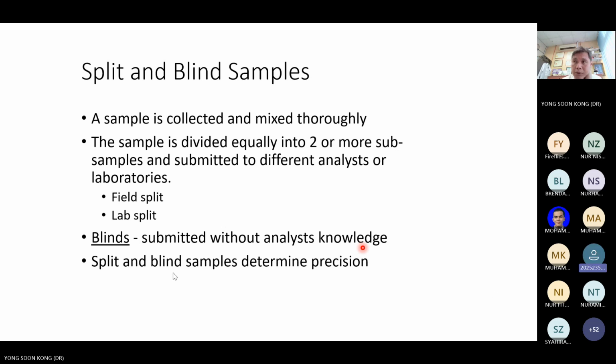Betul. Okay, dalam analytical chemistry tu, ada tak dia ajar apa yang saya sebutkan tadi? Blank, duplicate, spike. 3 ni. Ada tak? Blank ingat. Duplicate. Duplicate dengan spike macam tak ingat sangat.